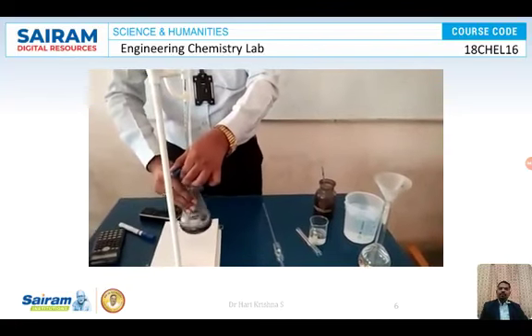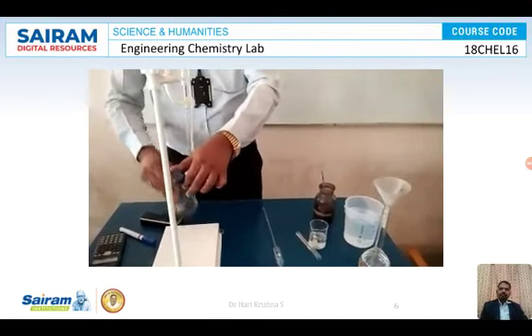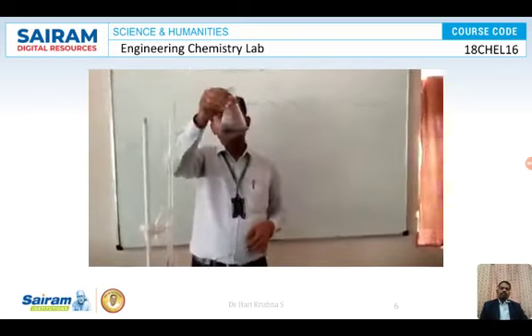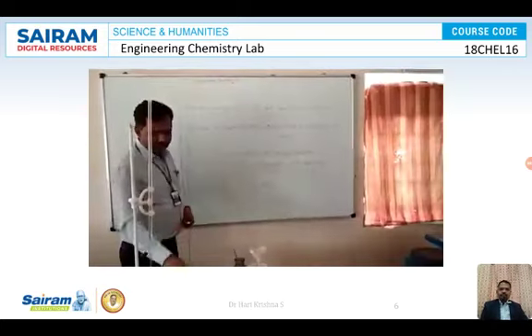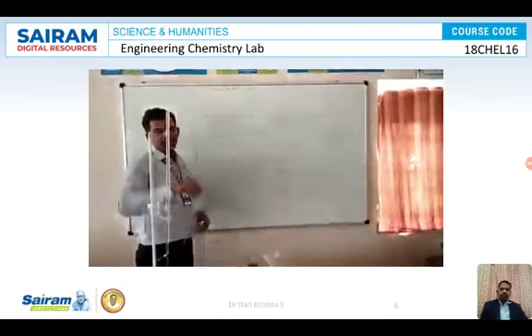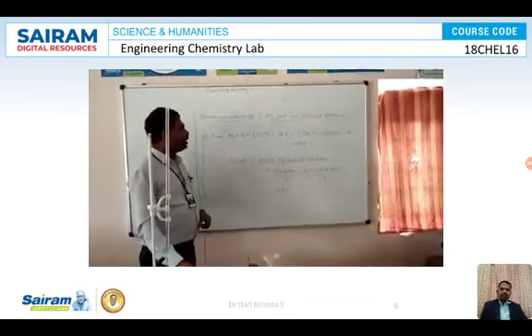Once you get this endpoint, stop the experiment. At the endpoint, the volume of Na2EDTA consumed was around 18.5 ml.